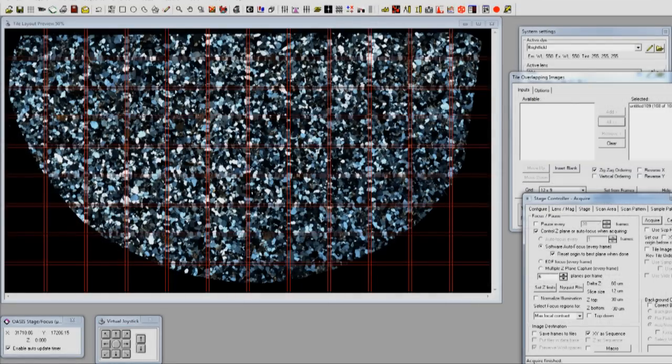The software employs an overlap technique, called a guard frame, to create virtually seamless transitions between photomicrographs.